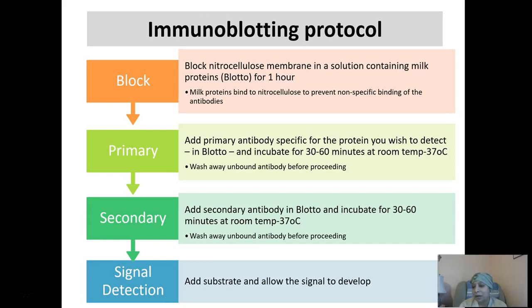For secondary antibody, you never want to go above an hour. You will get a lot of background if you do that. 30 minutes is the minimum you would do. I typically do 45 minutes, maximum an hour. Primary, you can, like I said, leave overnight. This one, you do not want to do that. And then we're going to add our substrate and allow the signal to develop that you can then examine.